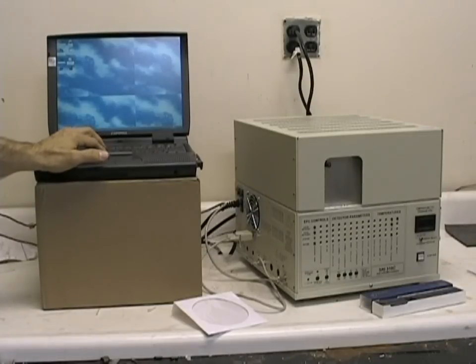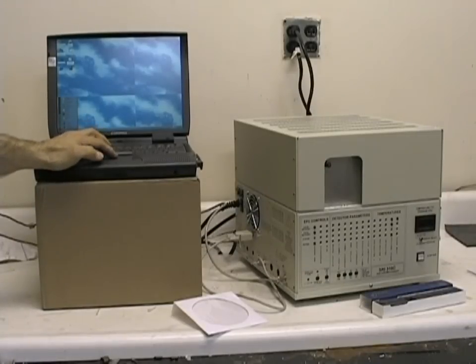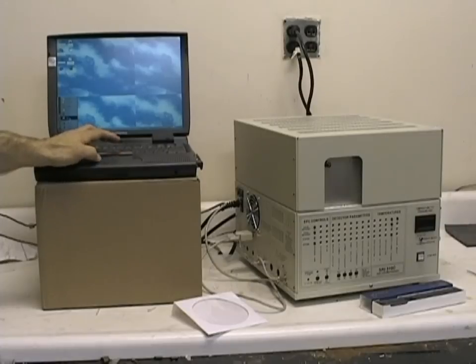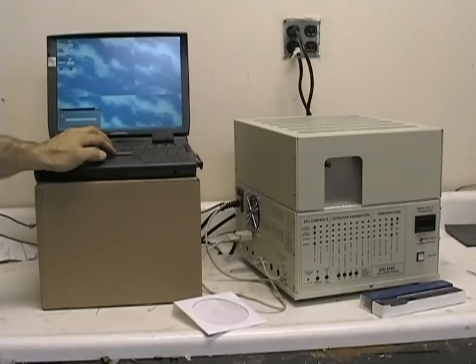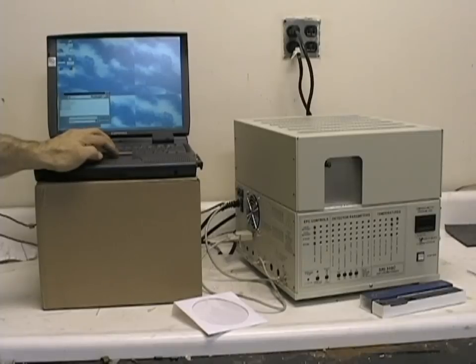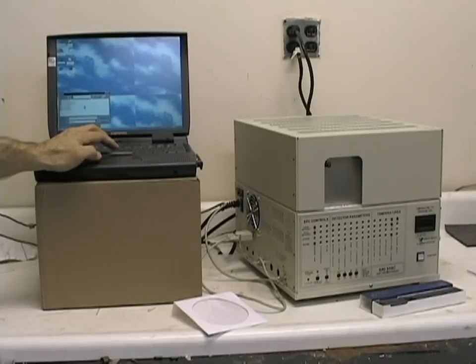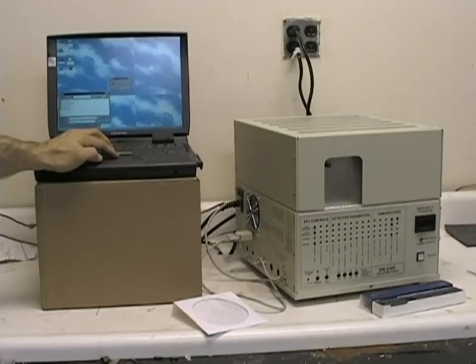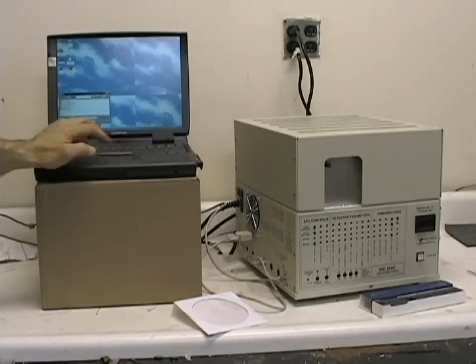Depending upon your operating system, click on start, run, and select the setup from the system.